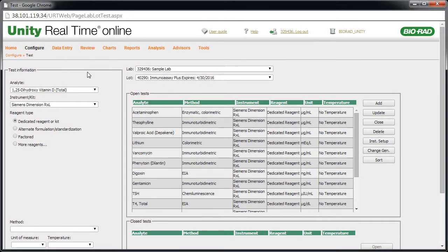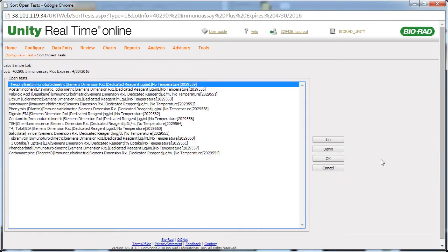Let's return to the Test page. Some customers may find it helpful to arrange tests in a particular order. Click the Sort button. Here you can move tests using the Up or Down buttons. Then click OK.